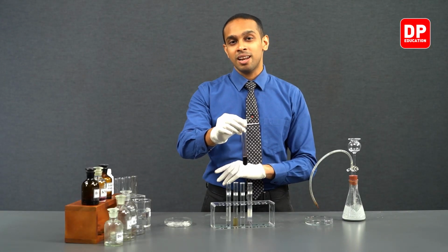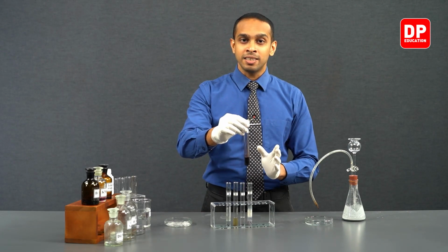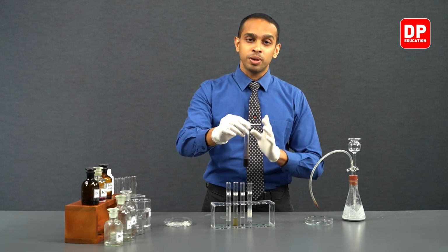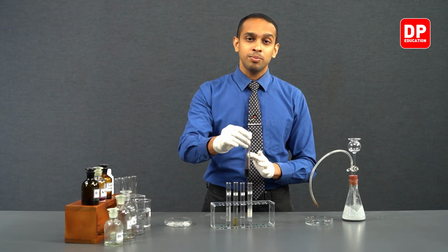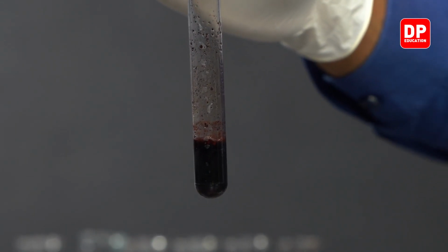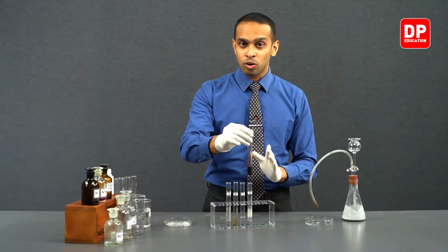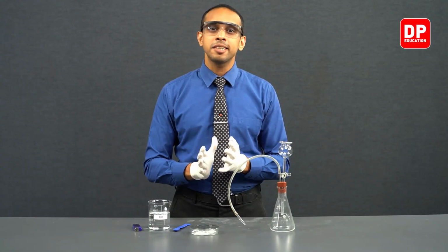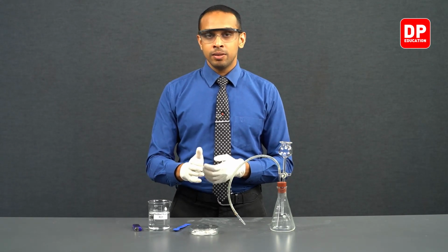Copper 1 acetylide is a reddish precipitate that was observed when we reacted acetylene gas with ammoniacal cuprous chloride solution. Ammoniacal cuprous chloride was blue in color, but when we reacted acetylene gas with it, the product that was formed was a reddish precipitate, which is copper 1 acetylide.